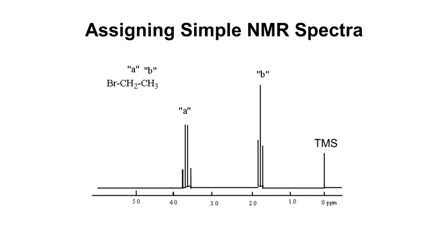And so this is an example of bromoethane. And we're seeing how, again, having an electronegative atom like bromine causes a distinct shift, moving the hydrogen atoms to this particular chemical shift, about 3.8. And then further down the molecule, which is physically located further away from the bromine, we have these B hydrogens, or B protons, which are at about 2 parts per million.